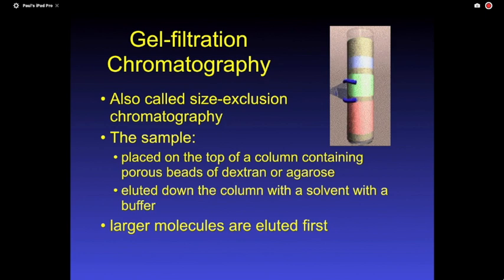Then you'd have a second peak with your second protein, and then no protein, and then you have a third peak, and you would have separated the three proteins very well. The problem is when you actually really do it, you get this peak that comes up and then starts going down, and then all of a sudden a peak comes up, but they're overlapping. That meant you didn't get good separation.